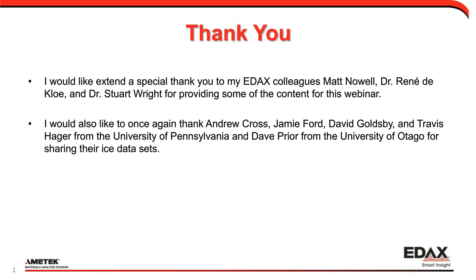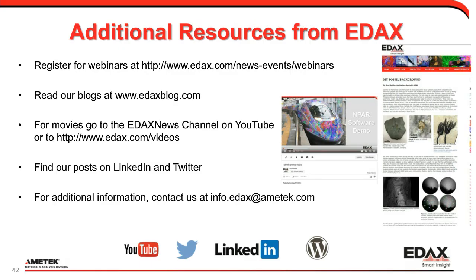I've added more resources, and while you look at those, I'll go ahead and answer some of the questions I have. Will a vertical bias change be needed for BCC or FCC? In general, no. The BCC or FCC default settings work for darn near anything. Some phases of steels can definitely have problems, but in general, generic FCC, BCC, and default settings work for base steels.